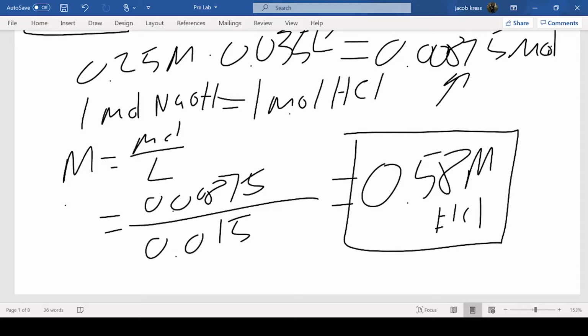So this is how titration problems are usually set up and how you usually get through them. You guys are going to see that this lab is a little different. We actually have starting concentrations for both the acid and the base in this one. We're going to be looking for something using the same kind of chemistry here. We're actually going to be looking for a different answer, which is really cool.